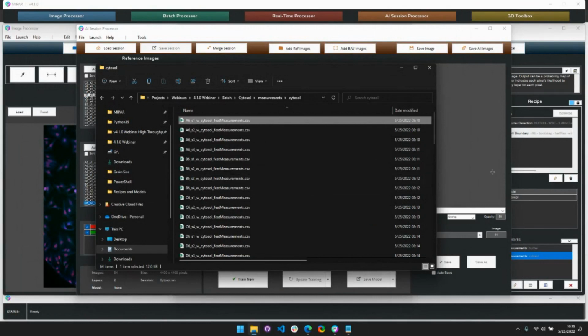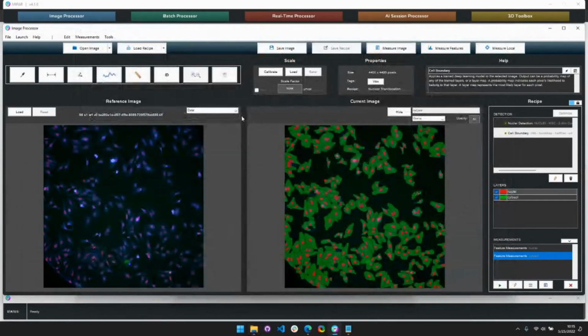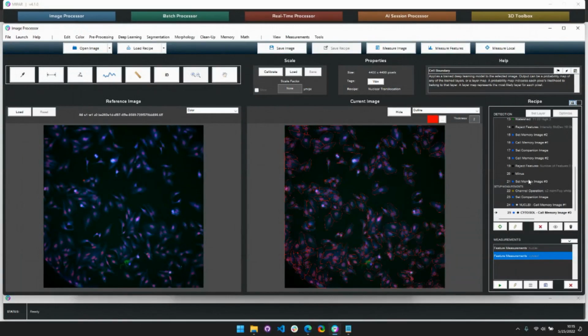just the classical applications. But what I'd like to do today is really talk about MIPAR's ability to quickly make robust recipes. So I have this recipe, right, and I'm able to find the nuclei in the cytosol, but let's say that I have a hypothesis that my marker of interest is not necessarily diffused entirely through the cell cytosol, but it's localized around the nucleus. So what I can do is very quickly say, okay, well, it's because it's around the nucleus.